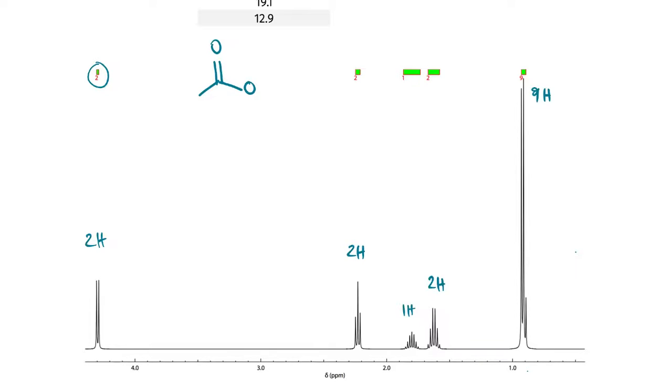These will be your functional groups that will cause chemical shift changes. Okay, the closer a proton is to an electronegative atom, like oxygen, the more shifted it will be. Halides also do that, but oxygen, nitrogen, phosphorus, and halogens are primary reasons why peaks shift around.